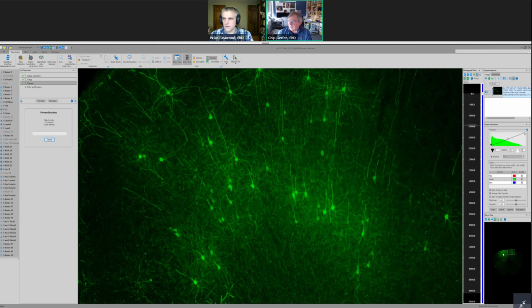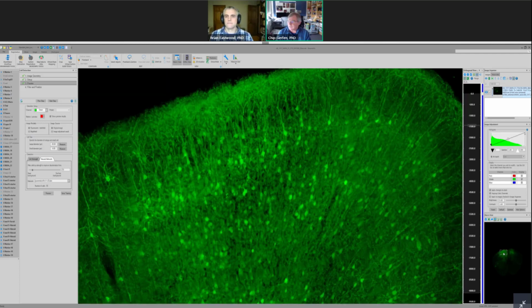And then I'm going to go to the opposite side. So this side is where neurons are fairly spread out and very distinct. It's the LOG, actually it works pretty well, but again, we couldn't apply just the cell strength function to get an accurate reading. So when we go over to the other side, there's a lot more processes that come into play.